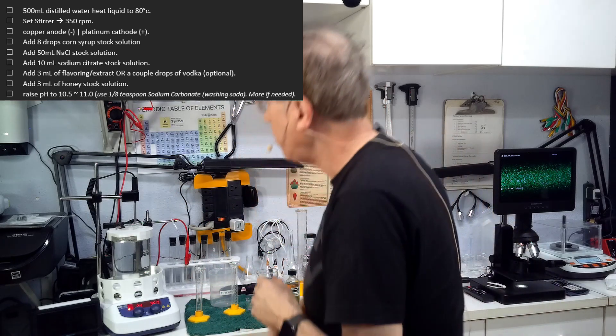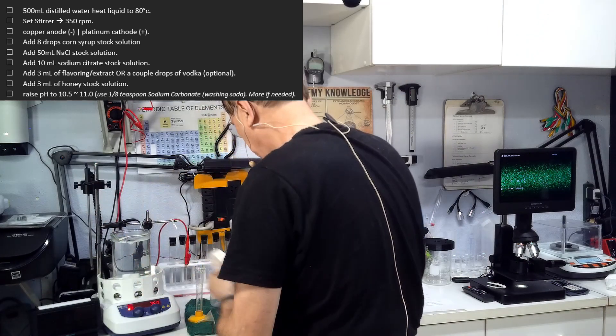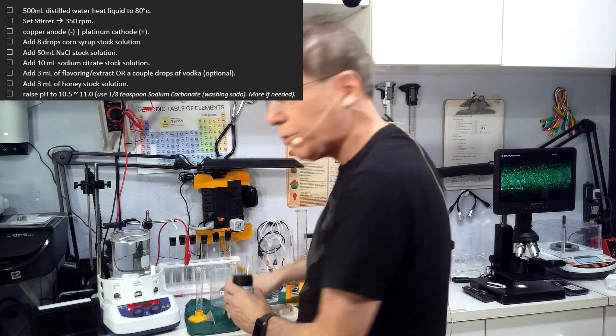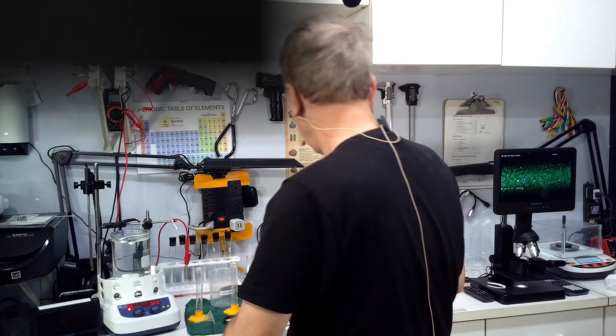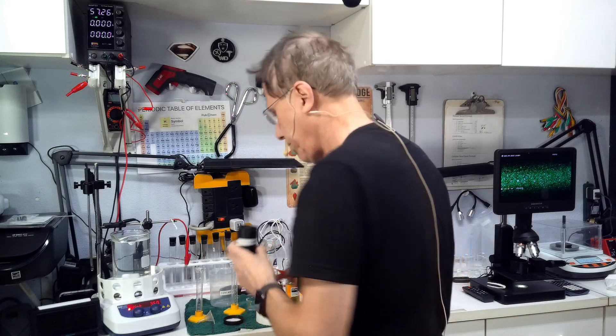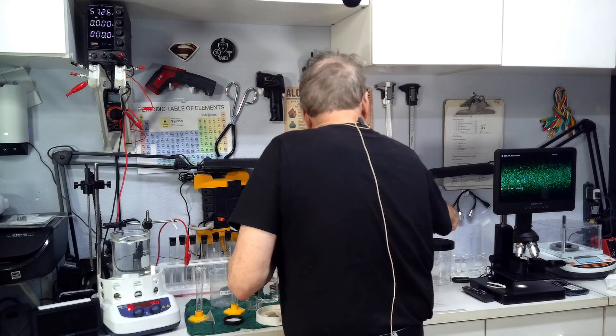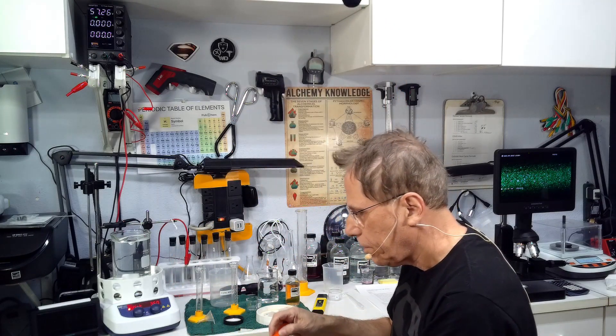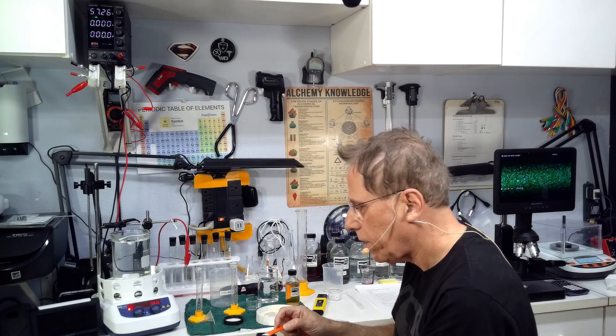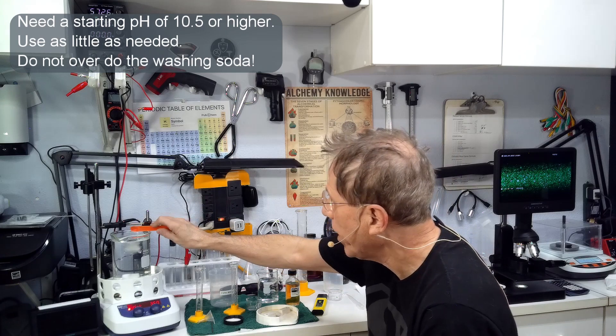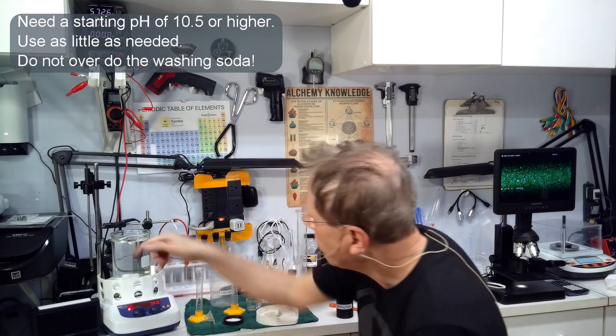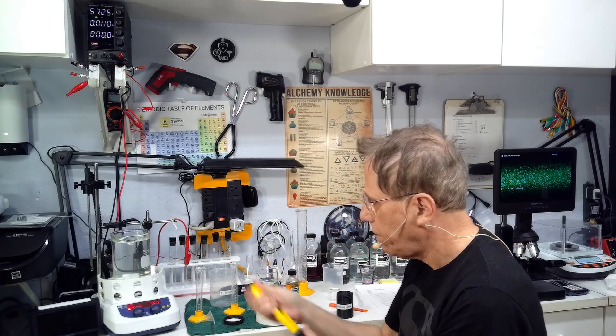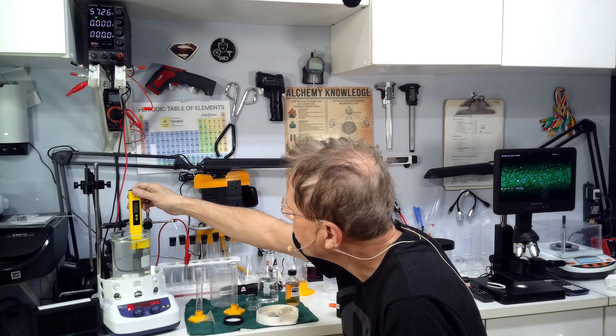Now we need to raise the pH. I like to raise the pH after everything is in. This is washing soda, it will bring the pH to 10.75. I'm going to add an eighth of a teaspoon to start with. Let that mix a little.